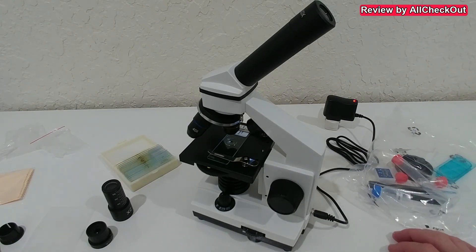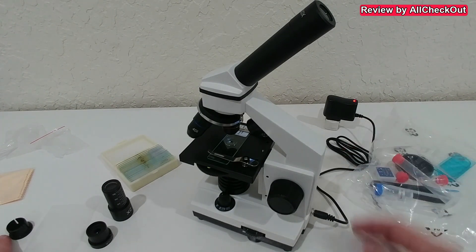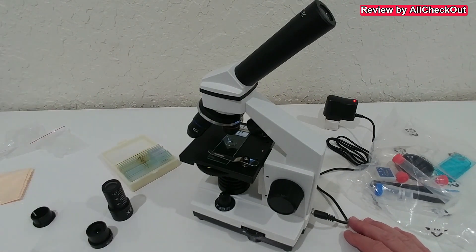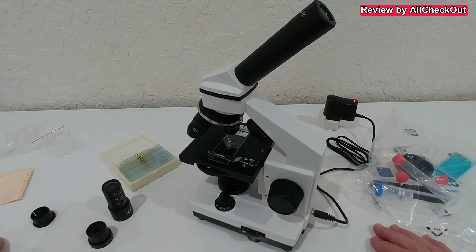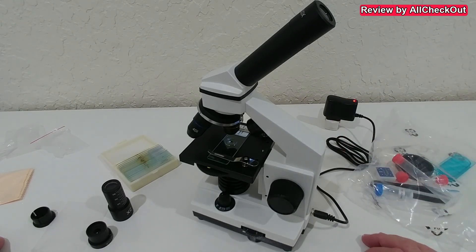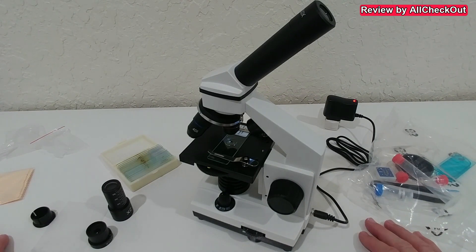I still can't find the phone holder — that may be a small disadvantage. I don't know if it's missing or not really included in this set, so if you really need a phone mount, better double check with the seller. But if you don't need one, I think you can't go wrong with this set. It's a really good beginner set, comes with slides and different magnification options, and the optical quality is really good. If you can get it for 150 dollars or even below, it's a decent thing.